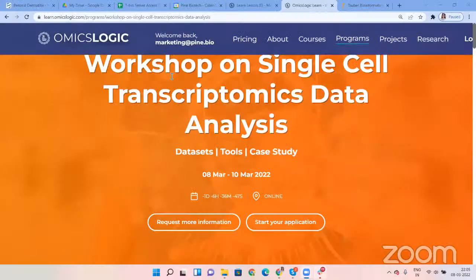Thank you so much, Dr. Raghav, for such a wonderful session. Sorry to interrupt, Sonalika. I will actually include a link for another data set in the Colab notebook, so you can have the freedom of trying this out in a new data set. This is also a 10x based data set, I think it's a brain data set with different cell types. So you can visualize how different data sets can be employed in a Seurat package to understand and annotate different cell types. Now, over to you, Sonalika.